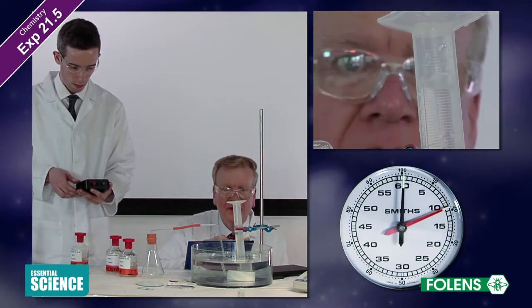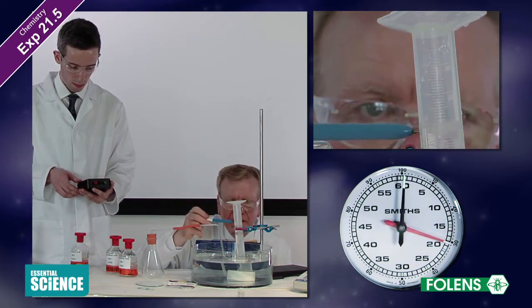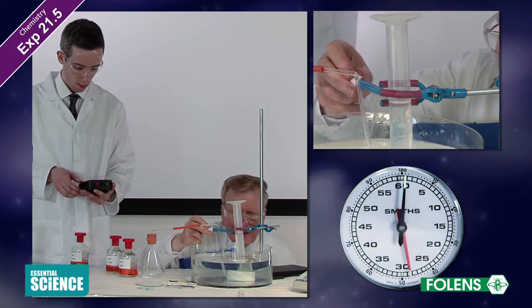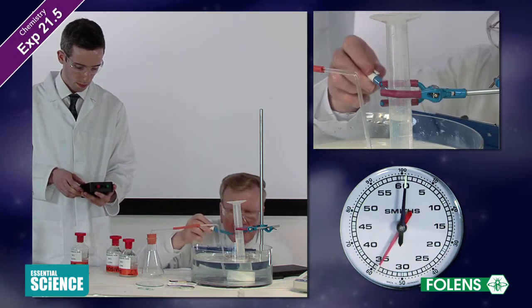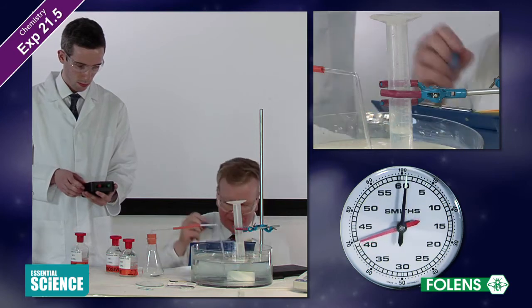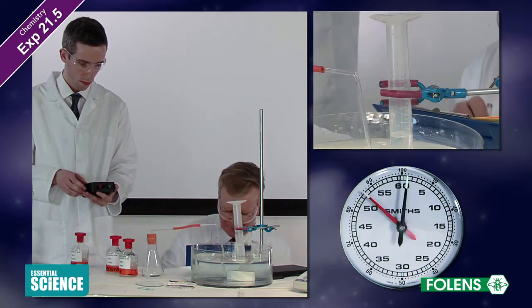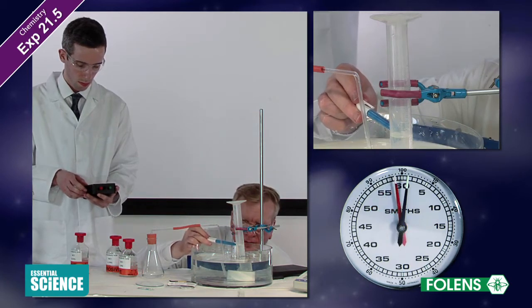Ten seconds. 20 seconds. 30 seconds. 40 seconds. 50 seconds. 60 seconds.